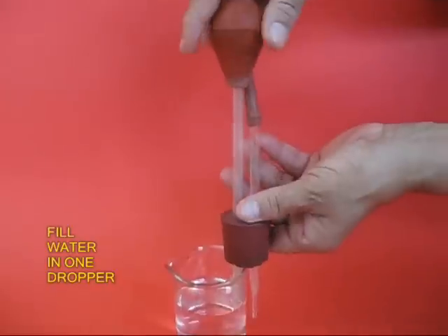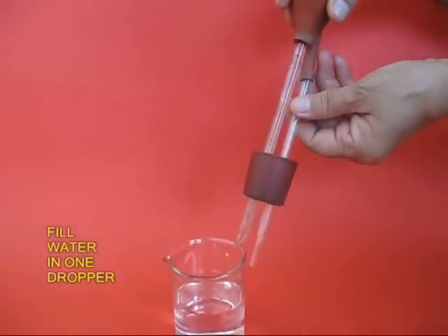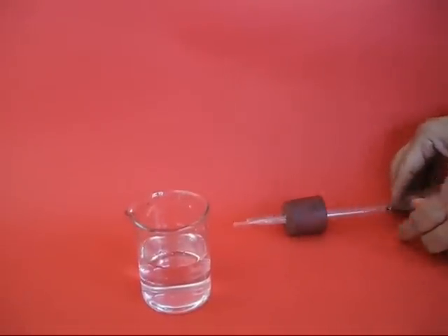Now place the two droppers in water. Press the bulb so that this dropper is filled with water. Keep it aside.